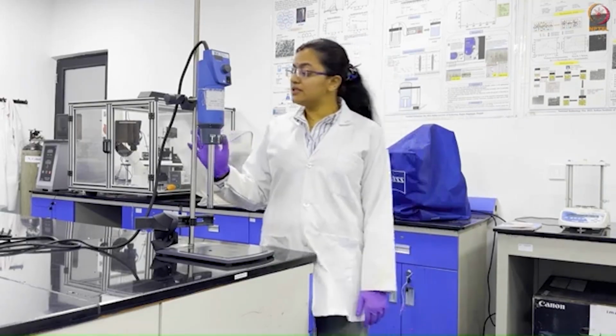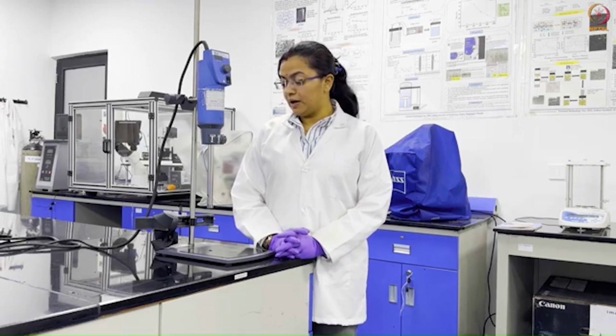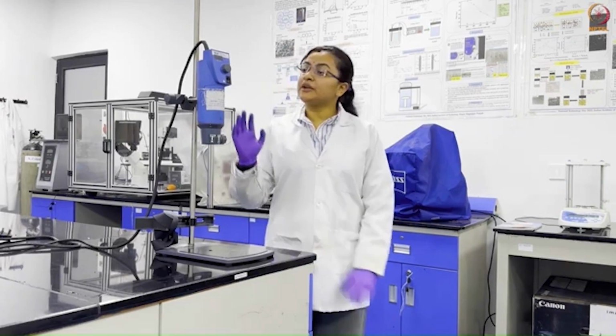Now this homogenizer can homogenize, disperse and mix samples. It has two parts, rotor and stator. The rotor part has high shear forces, and then the stator part provides a stable platform for mixing. The speed at which it can move is from 3000 rpm to 25,000 rpm.